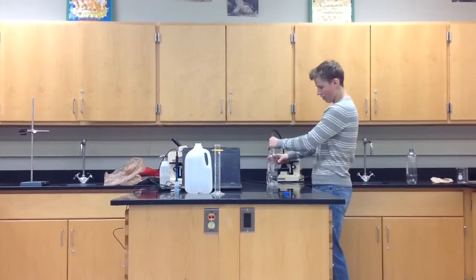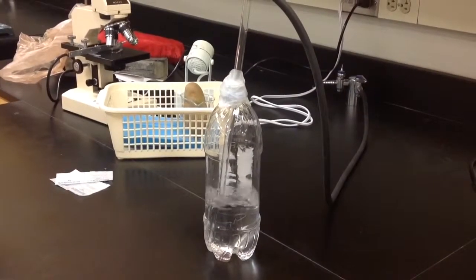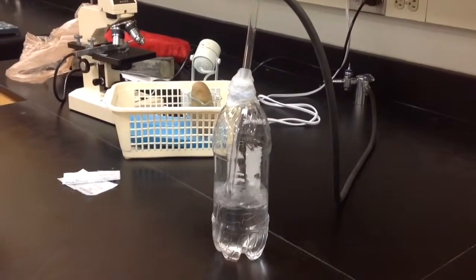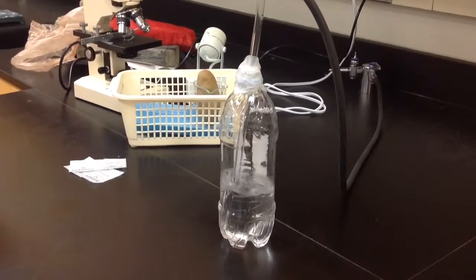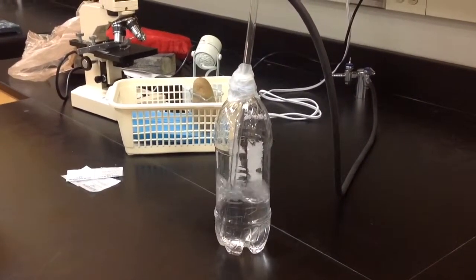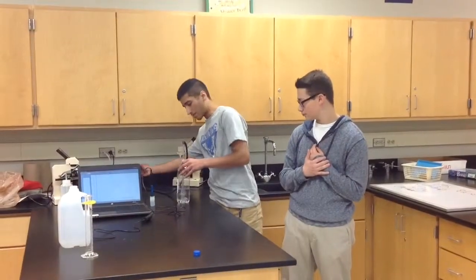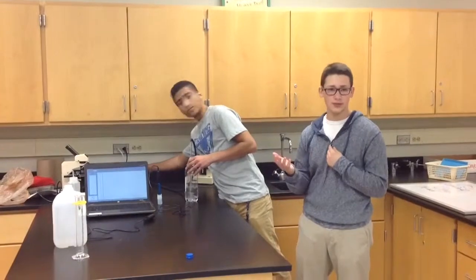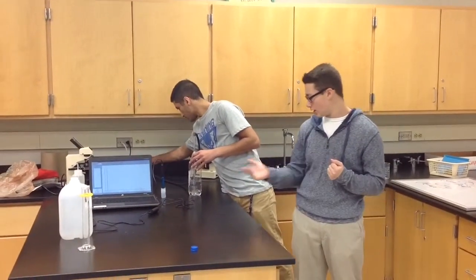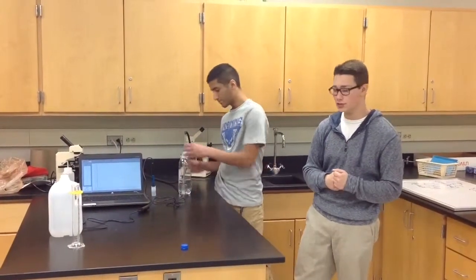And I will now turn on the methane. So right now the methane gas is going into the distilled water, and methane and CO2 are both greenhouse gases. So we are going to see which one has a greater effect on pH. Now we are turning off the methane gas. It has been approximately 4 minutes. The methane was going into the water faster than the CO2, so that's why we're doing half the amount of time that we did for the CO2.